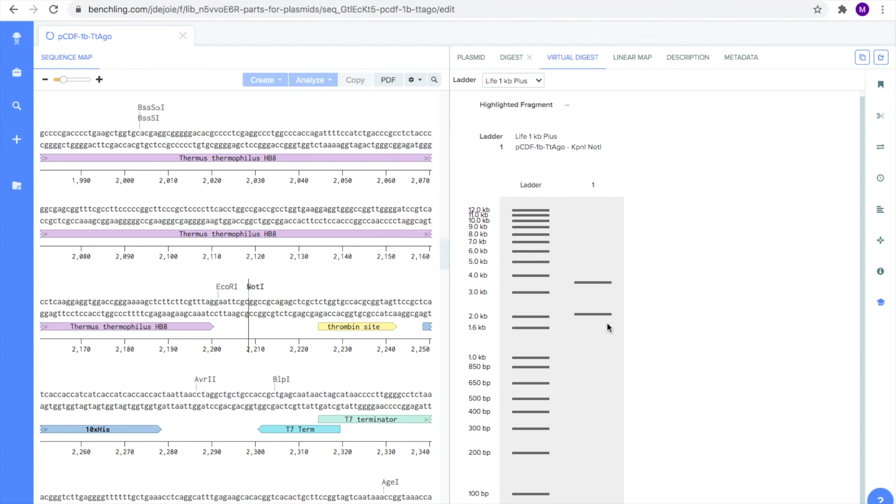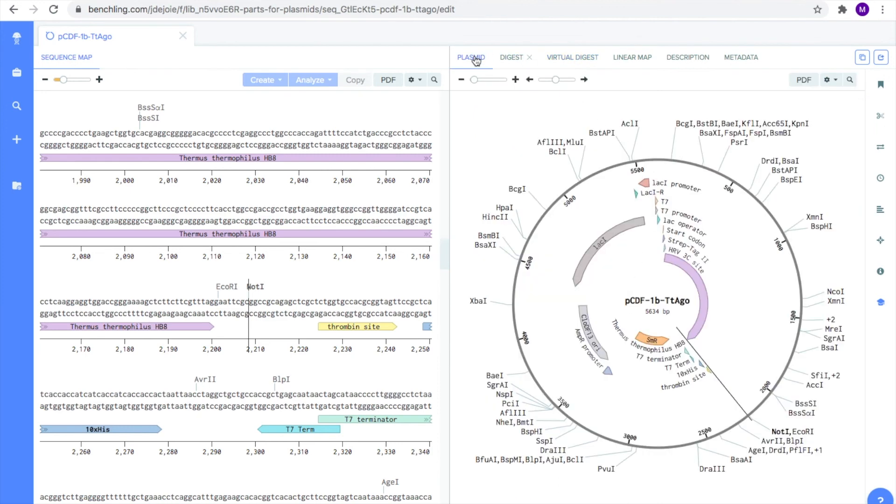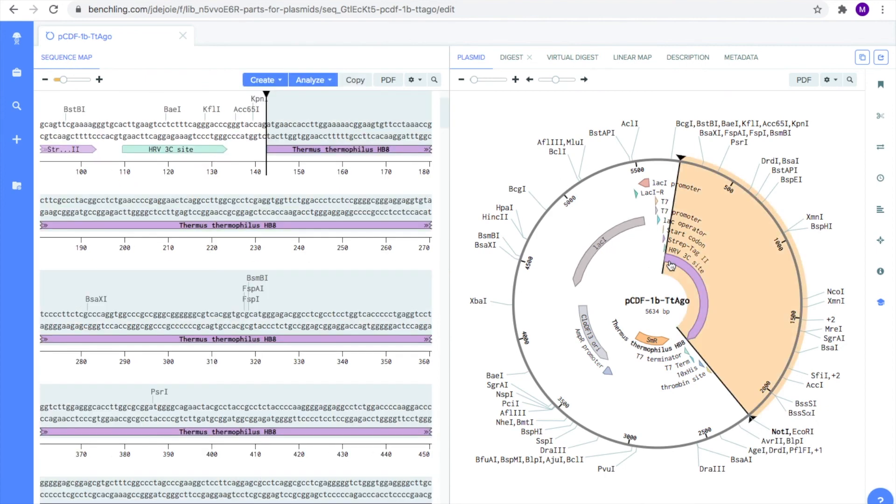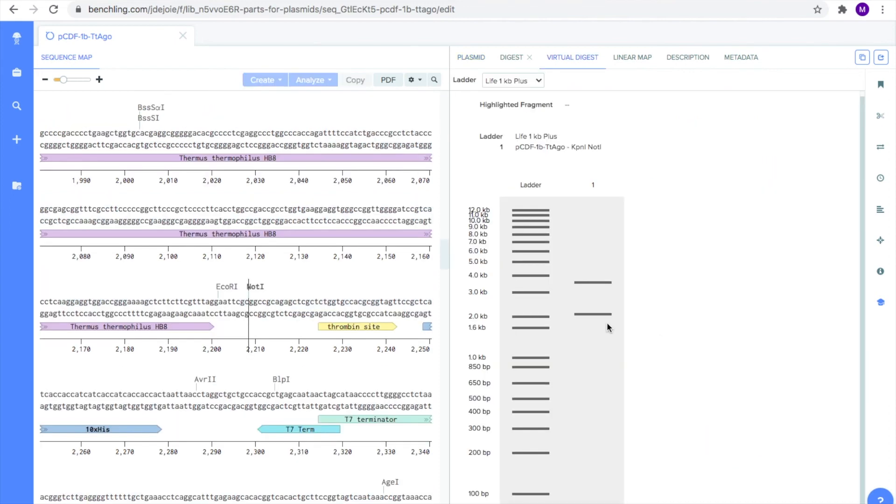So, how do we know which band contains our gene of interest? Intuitively, if we look at the map of our plasmid, we know that our gene takes up less than 50% of the plasmid and is, therefore, the smaller fragment. Since we know smaller fragments travel further in the gel, we know our gene must be the bottom-most fragment which is between 2 to 3 kb or kilobases.